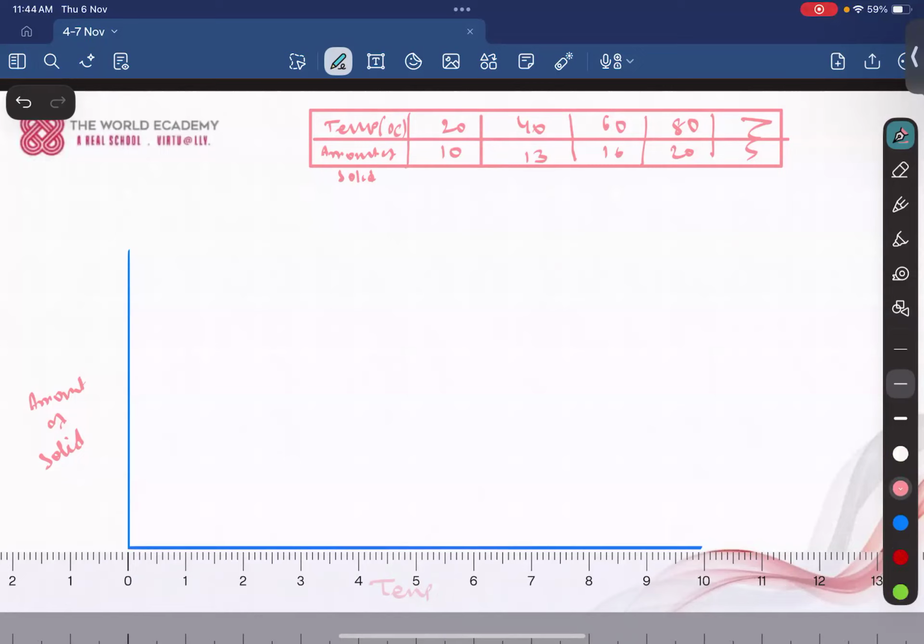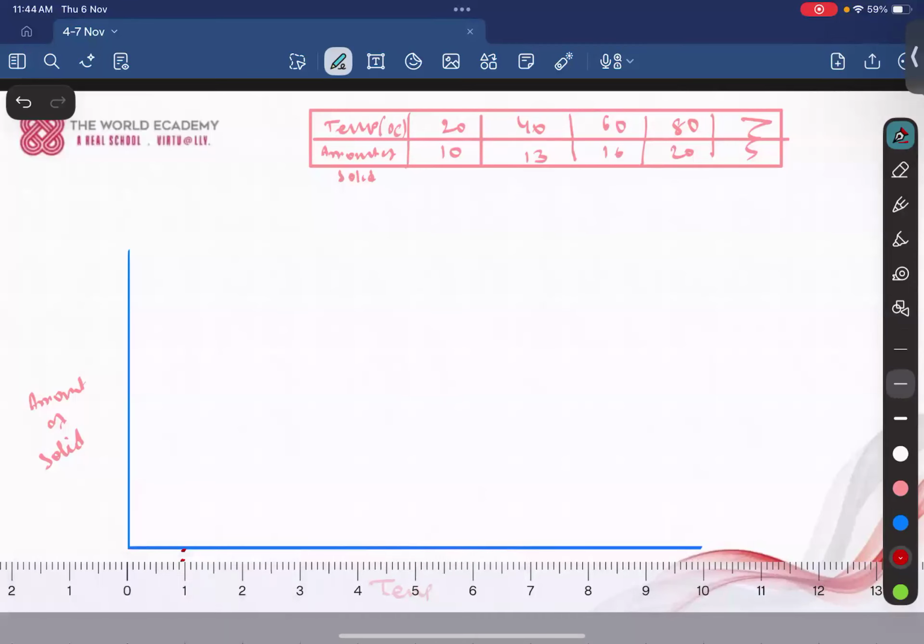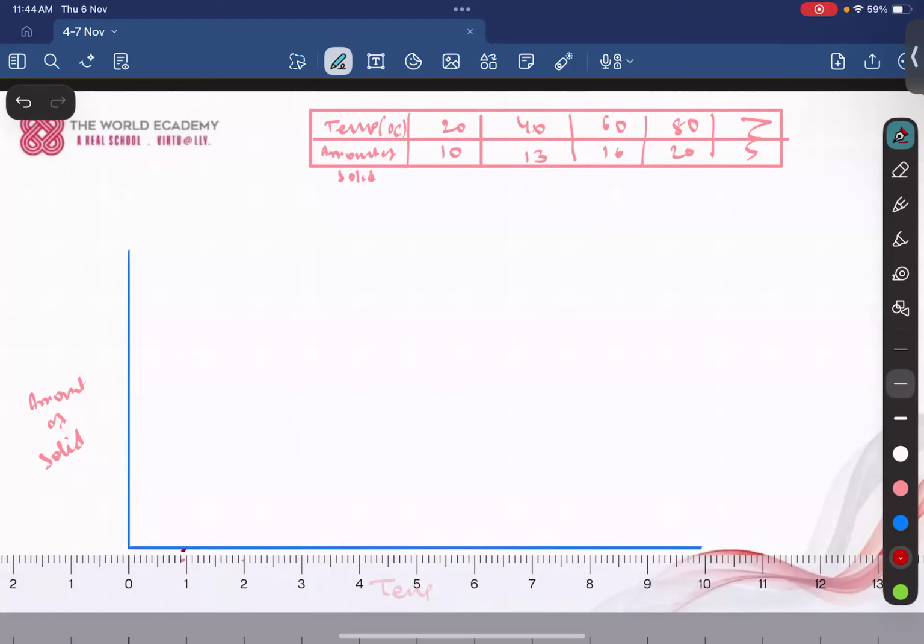Okay. So the red color I am taking. See, this is 10, 20, 40. So it is coming in 20 divisions, right? So every one, this is called one, right? It signifies every one unit, here it will be 20. So let's mark.